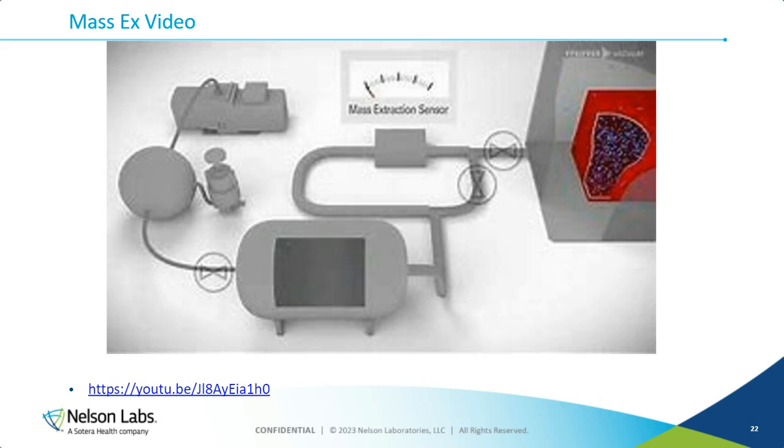There's this video. I don't think it's going to play, just to give you a heads up, but it's on YouTube. All you have to do is look for mass extraction. You can find this. It's put out by Pfeiffer Vacuum. They purchased ATC, which is the maker of our machine, and they're the ones who really got the mass extraction standard written and got it all set up.